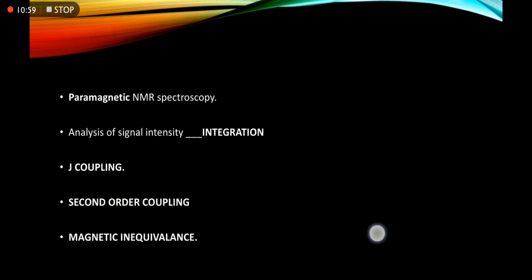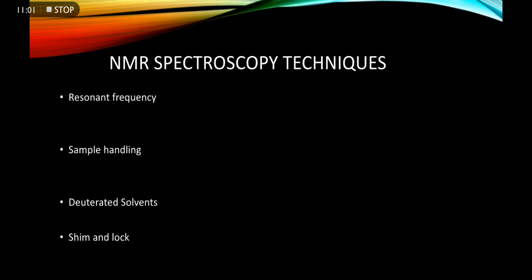Move to the next slide. The NMR basic spectroscopy techniques. Okay. The first technique is about the resonant frequency.